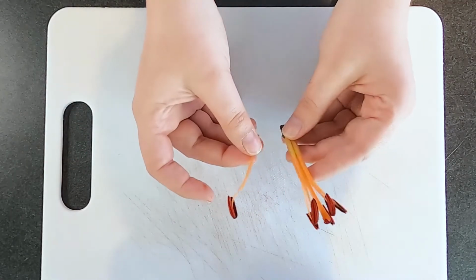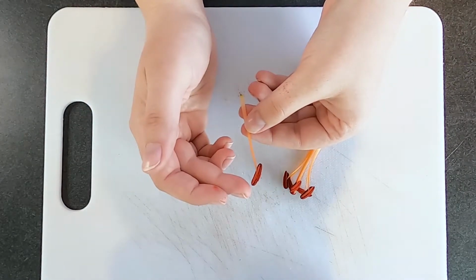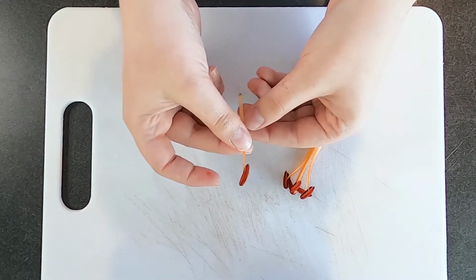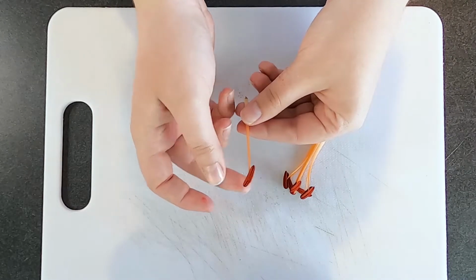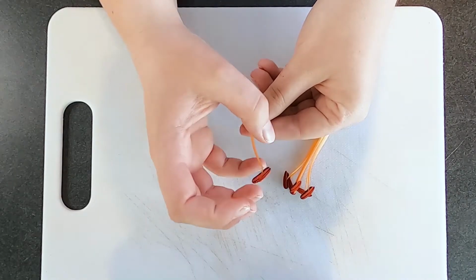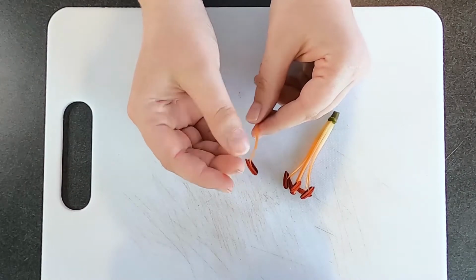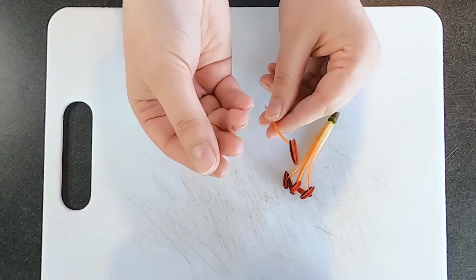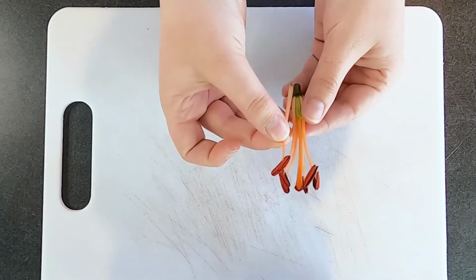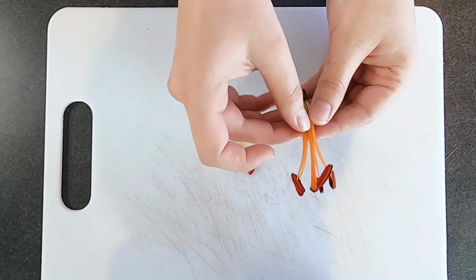I'm just going to take one of these off. So we have what is called the stamen. So on top we have, this is all a stamen. On top here we have an anther. And we have the filament. The filament is used just to hold up the anther and deliver nutrients and stuff like that. The anther is what's important because that's creating all those pollens. So there's nice pollen sacs in there that all kind of burst together. So you can see on my finger here, there's some nice, this orange gritty little pollen pieces, and there's millions of them on each anther, which gives you very good chances of spreading your pollen to other flowers or to the same flower. So we can take all of these off.